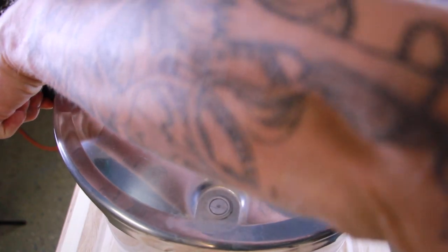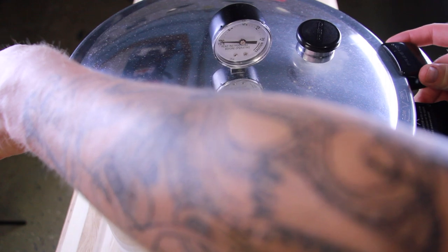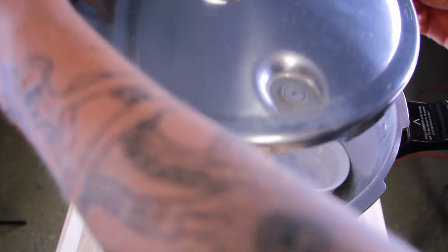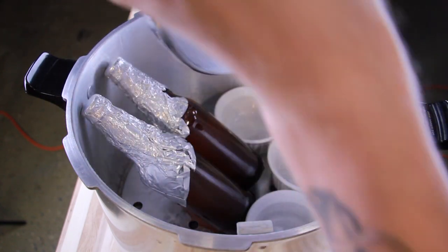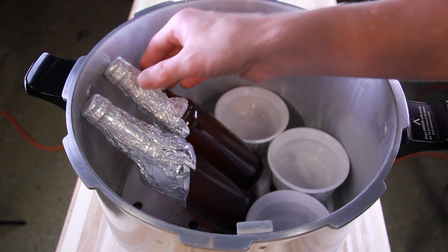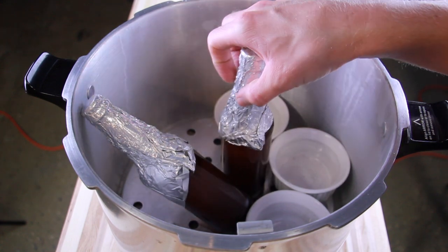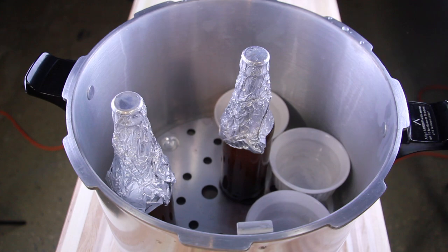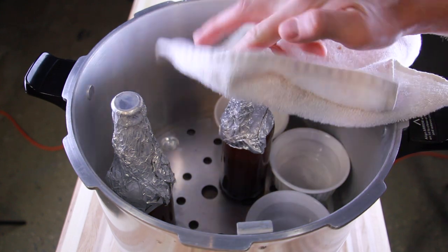I let the pressure cooker cool down until the outside was still pretty warm to the touch. It definitely wasn't hot and it wasn't boiling anymore, but I didn't want the agar to solidify, so I got it out while it was still pretty warm. I definitely recommend using gloves or a rag to pick up your bottles at this point, because it was still pretty uncomfortable to grab them with my bare hands.